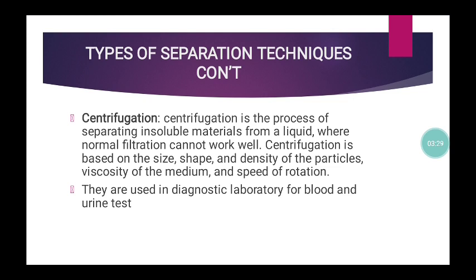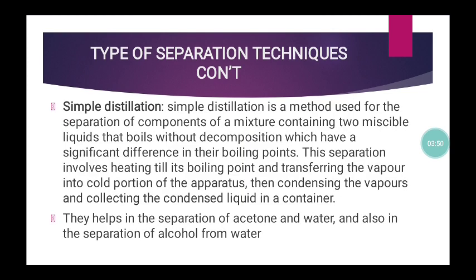Another type of separating technique is centrifugation. This is a process of separating insoluble material from a liquid where normal filtration cannot work well. Centrifugation is based on the size, shape, and density of the particle, the viscosity of the medium, and the speed of rotation. It is normally used in our laboratories for blood and urine tests.